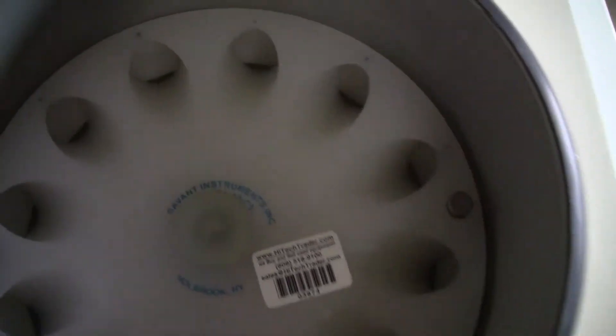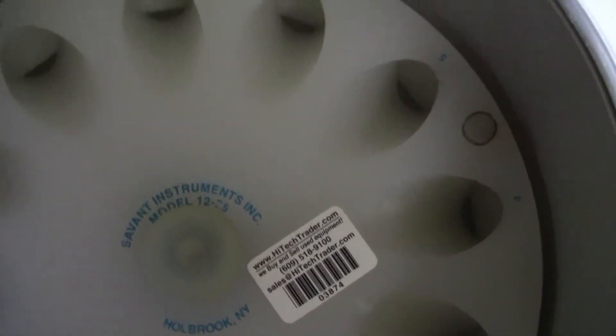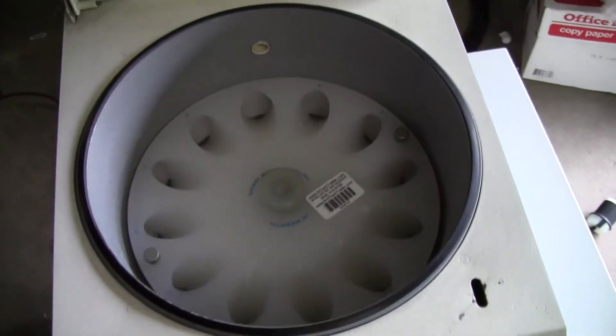This does have a Savant model 12-28 rotor, 12 place, 28 millimeters.